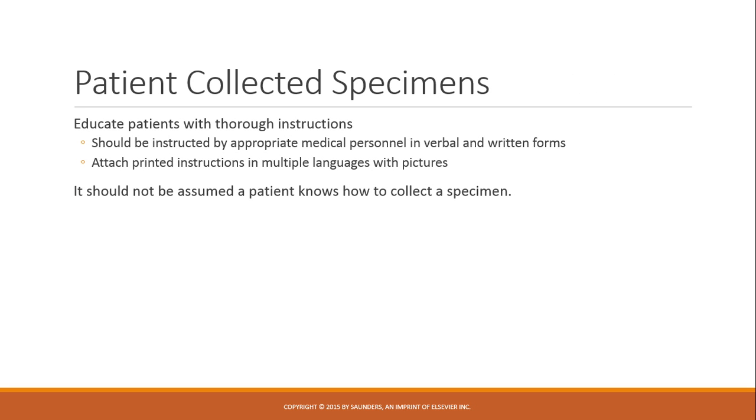Now, patient-collected samples, these are pretty common, actually, where the patient is instructed to collect the sample. And unfortunately, we're not involved in this either many times. But the nurse is supposed to explain to the patient how to collect the sample. And they may use technical terms. They may completely avoid describing the process altogether. So it's important that we give the patients instructions, not only written, but also verbally and also with pictures to help them understand exactly how to collect the sample.